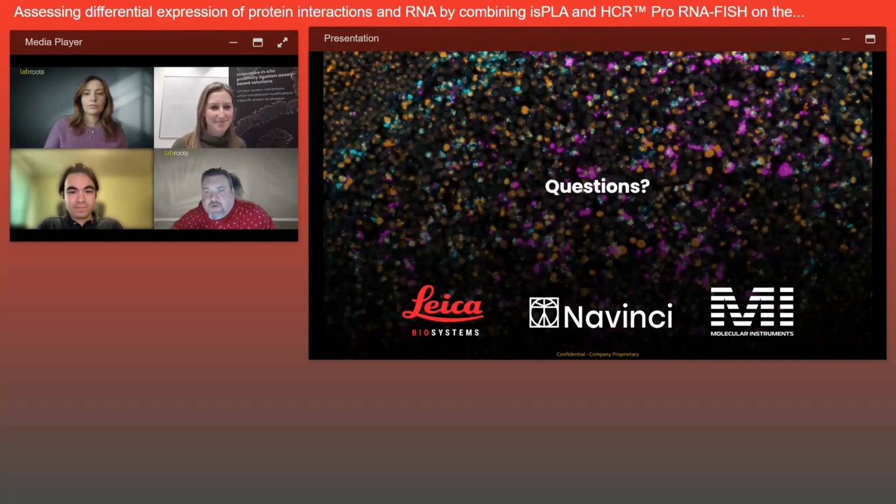All right, this one was for you, Joycelyn. My understanding is competitors have gone protease free too. How does HCR compare with that? Yeah, so we can't speak to the development of competing technology, but again, HCR has always been protease free from the start, so it's never needed it, even while it was still being developed at Caltech.